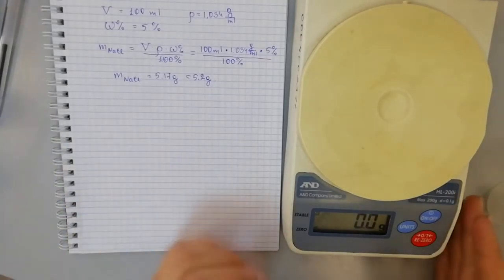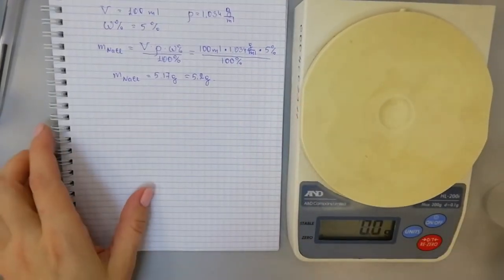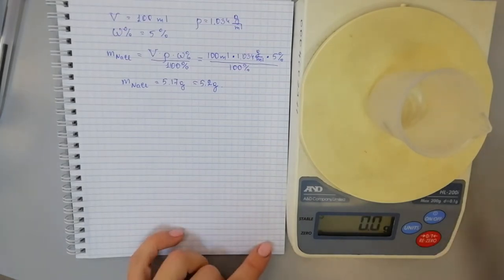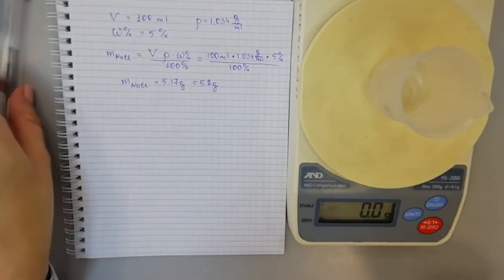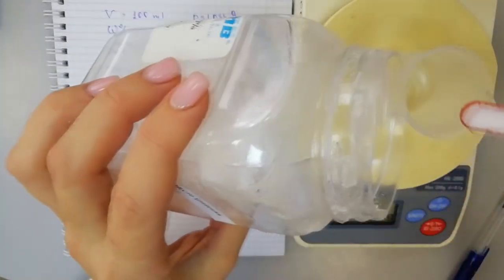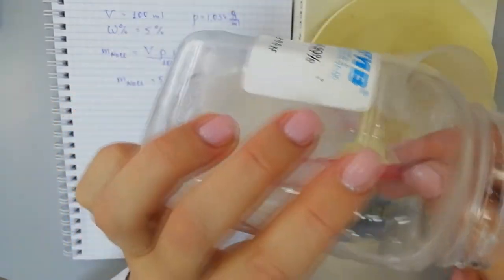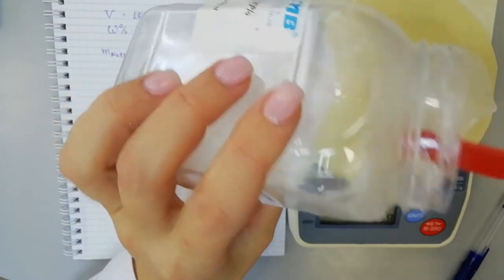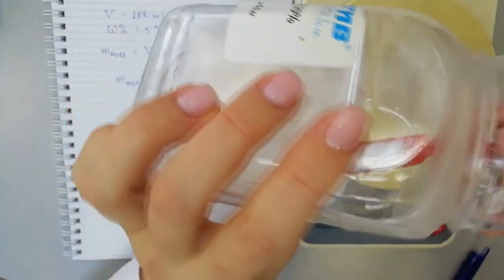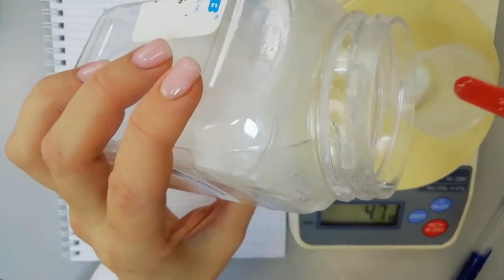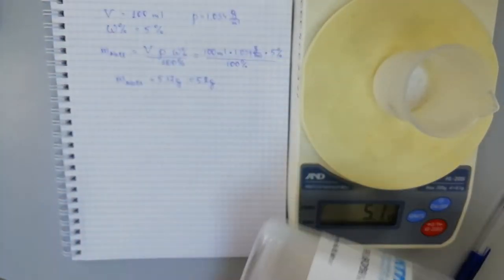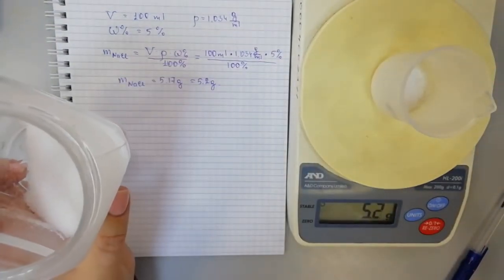Now we weigh the sodium chloride. We take an empty glass and put it on the scales, then press the red button to zero the weight of the glass. We take a spoon and start adding salt to the glass. The reading reaches 5.1, so I switch to a smaller spoon and bring it to 5.2 grams.